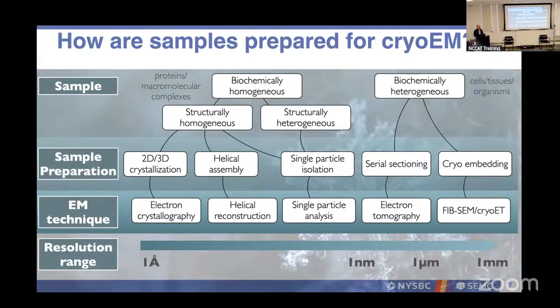Okay. So, if you have a 1 micron thick sample, you can still image that. It's just that you won't be accessing this particular resolution regime. It'll be more towards that. And that's why it's very important to also understand what is sufficient. It's always nice to be subatomic, but it might not be resource efficient to get there, nor necessary for your biological question.